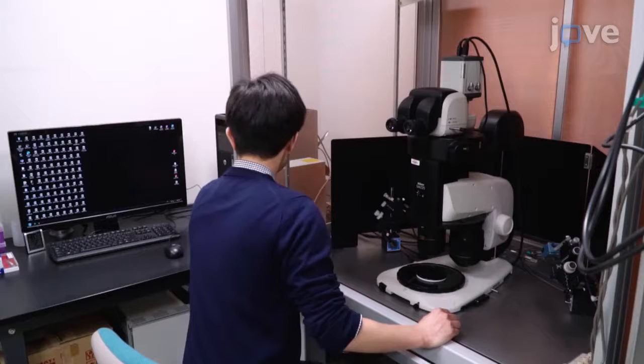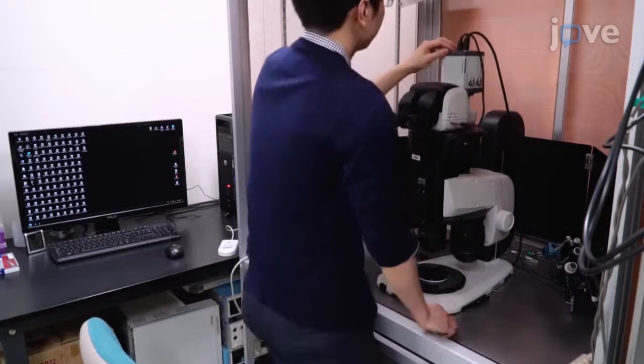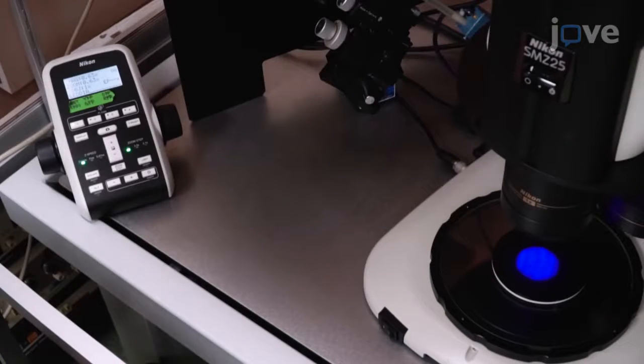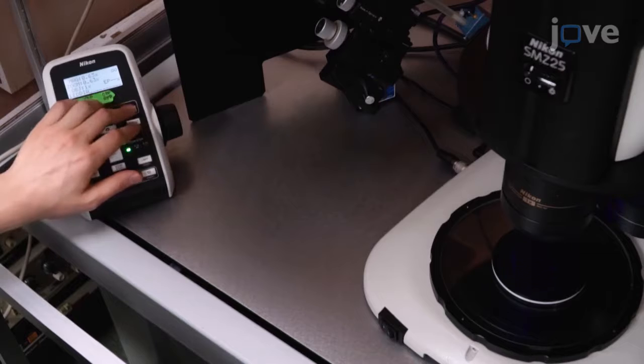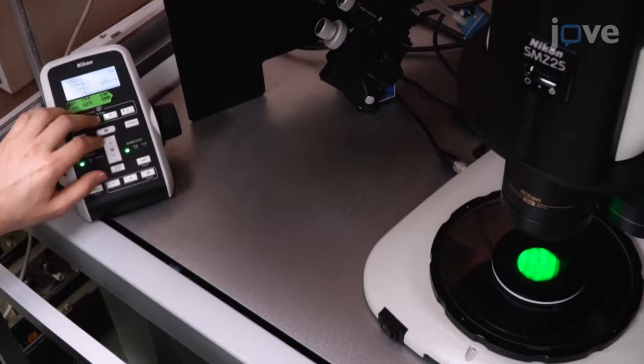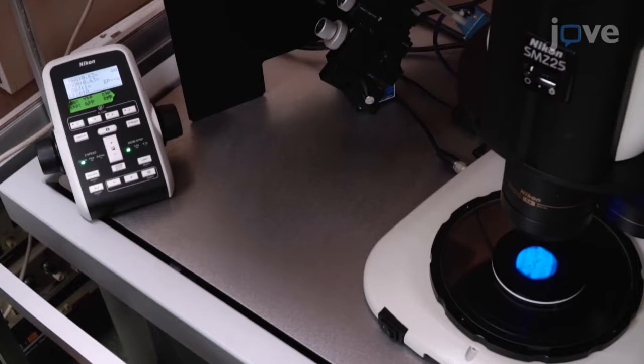Begin by turning on the motorized fluorescent stereo microscope equipped with a 1x objective lens and a sCMOS camera. Configure the device settings to irradiate with excitation light centered on 470 nanometers, selected using a filter that transmits light between 450 and 490 nanometers. Acquire emission light using a filter that transmits between 510 and 560 nanometers.